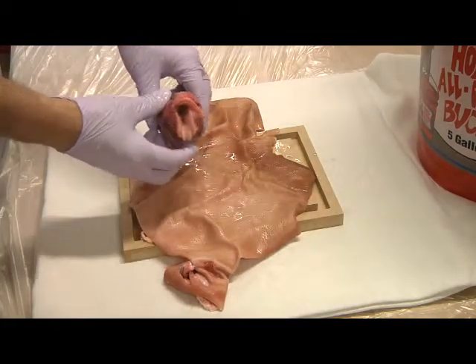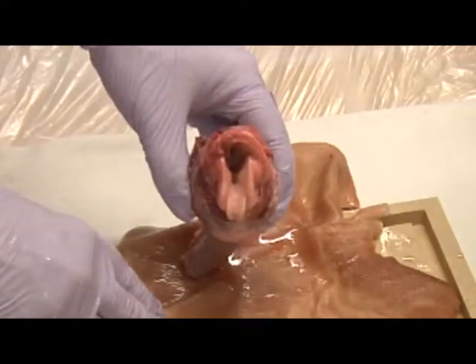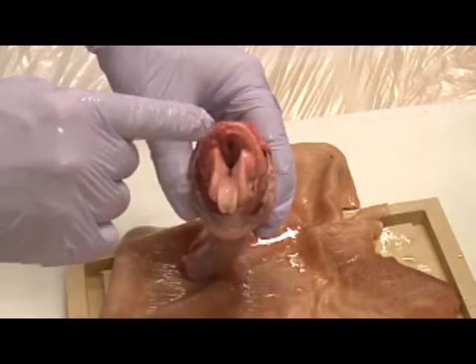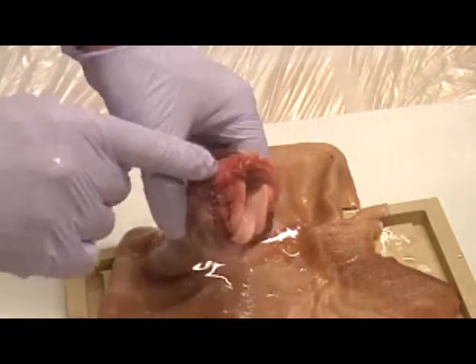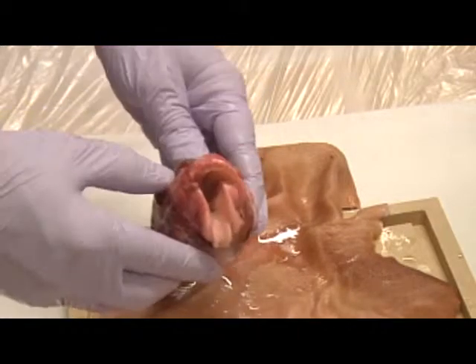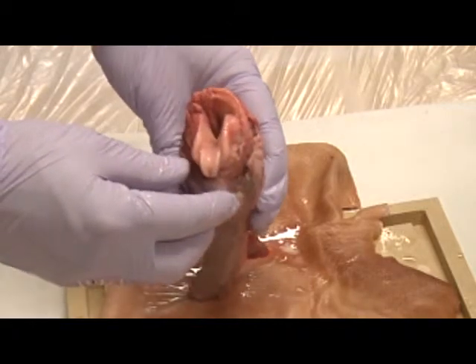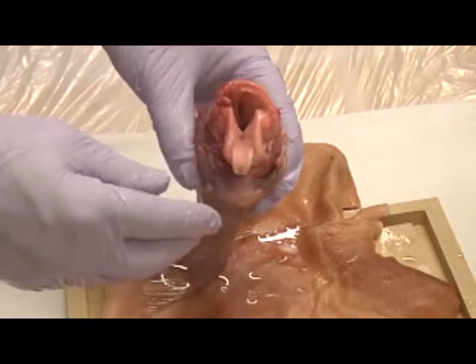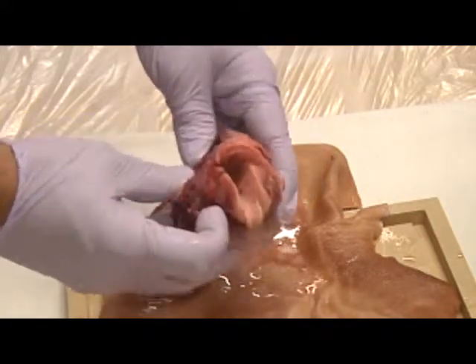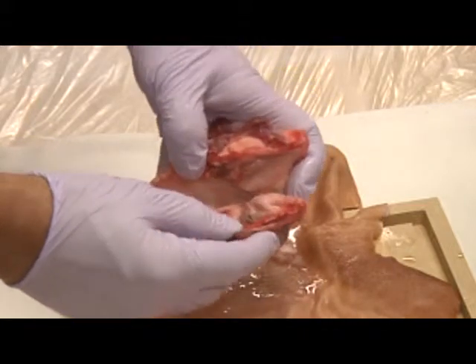So here we have the swine larynx and trachea. It does not appear as a human trachea would. Here we have the arytenoids, here we have the thyroid cartilage, and in fact on this specimen part of the thyroid cartilage has been cut away. When you're procuring your tracheas, you may want to procure more than you actually need because often the slaughterhouse will destroy some of the specimen. In fact, this specimen has been pretty well split, and we can open up the thyroid cartilage.